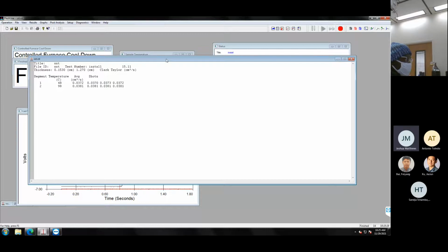The furnace is controlled through the furnace thermocouple. That is for heating rate purposes. If it were controlled through the sample temperature, it would be almost impossible to hold the temperature at a good value.